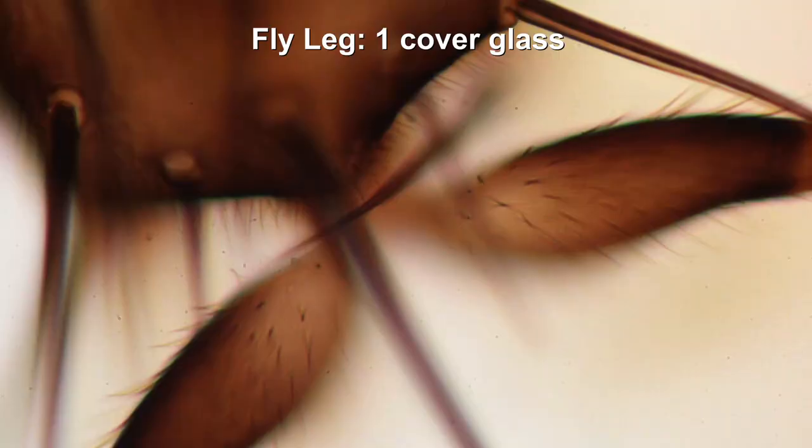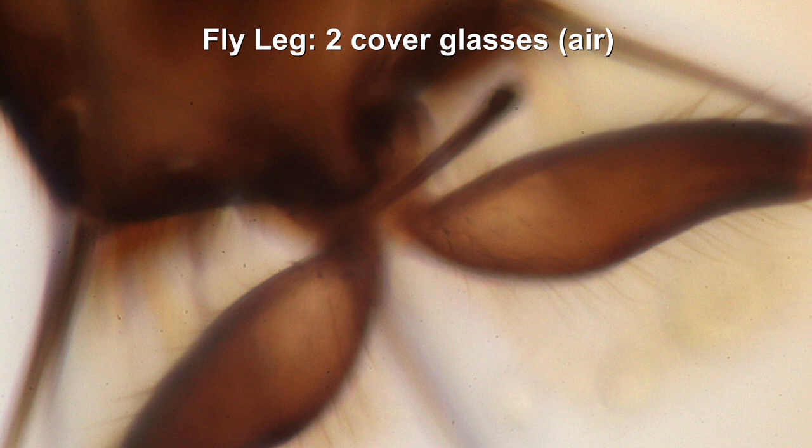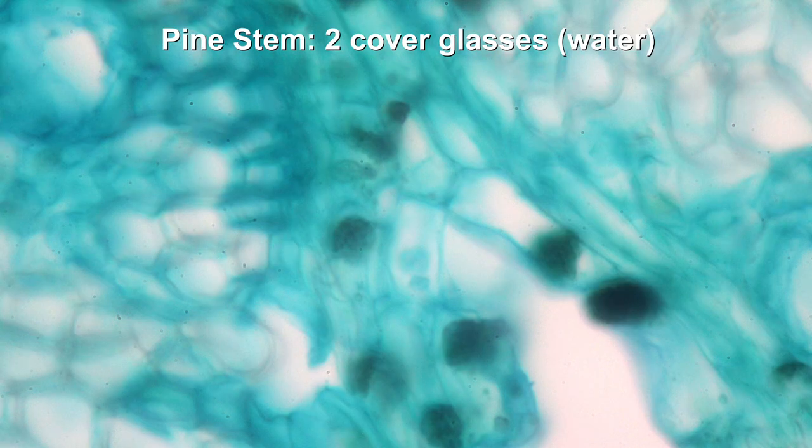In every case I opened the condenser to allow for maximum resolution, which also lowers the contrast a little bit. That is the original with only one cover glass — the original permanent mount. Here is the one with two cover glasses together with water, and we already see a notable decrease in image quality. It gets a little bit worse even when there is air between the two cover glasses. We can see a similar pattern in the other specimens as well.